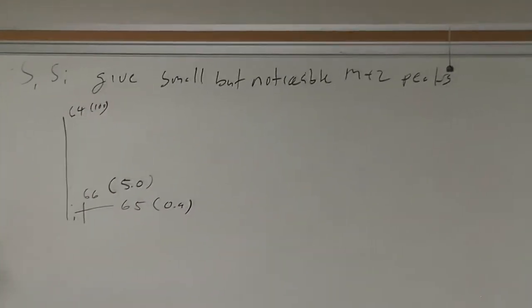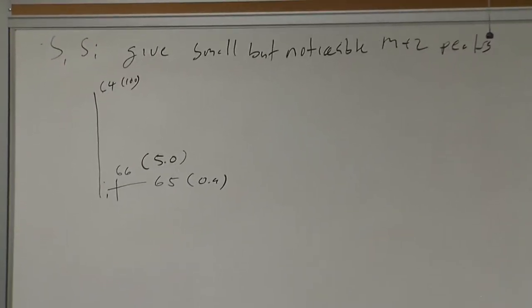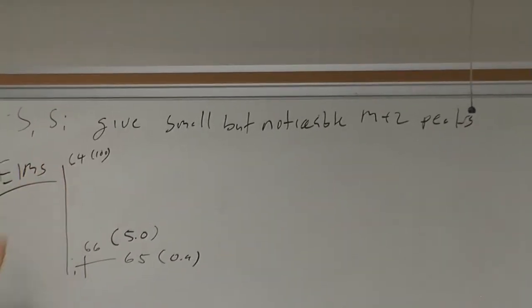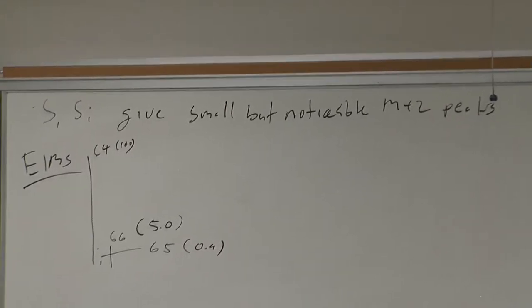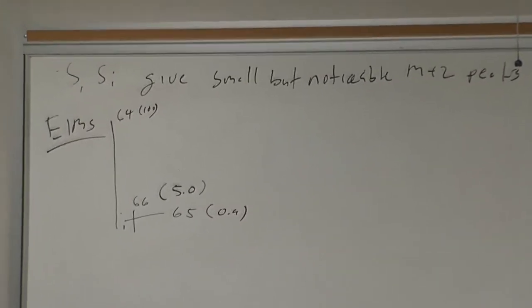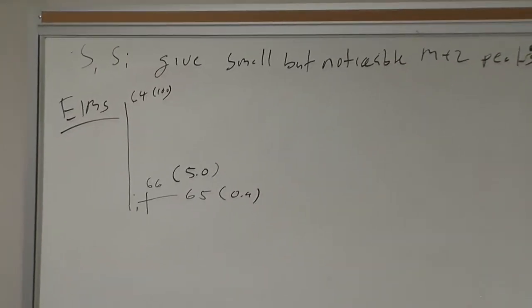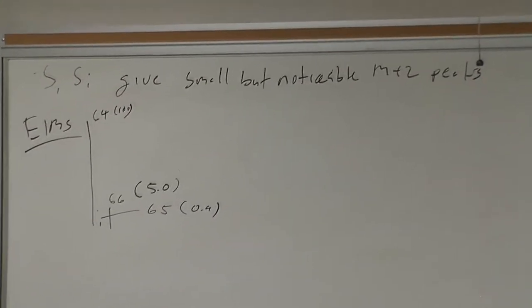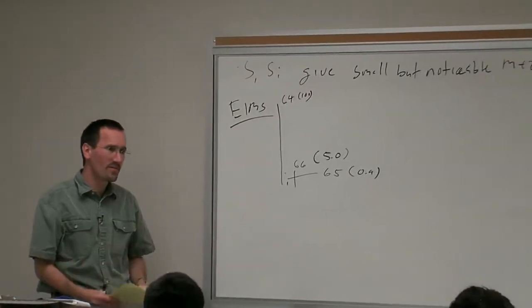And so the question is, this is a real sketch of a real EI mass spec. And so the question is, what's the compound? Okay, we have DMSO.